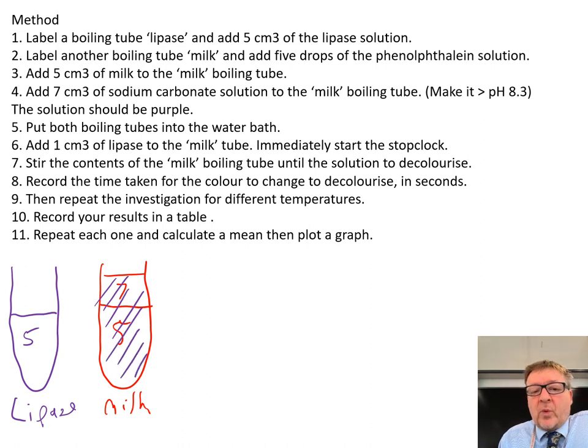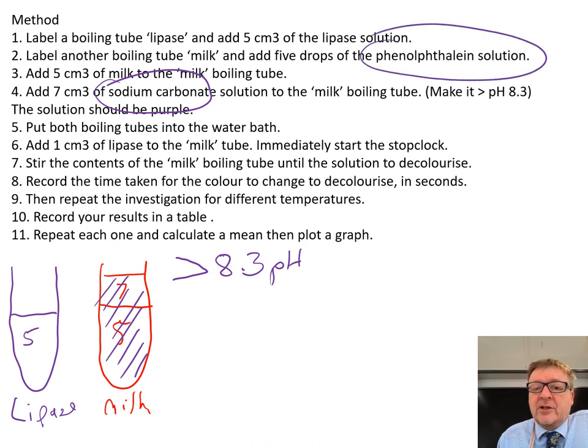The solution goes purple because the sodium carbonate is alkaline and makes the solution greater than a pH of 8.3. Above pH 8.3, the phenolphthalein indicator goes purple.